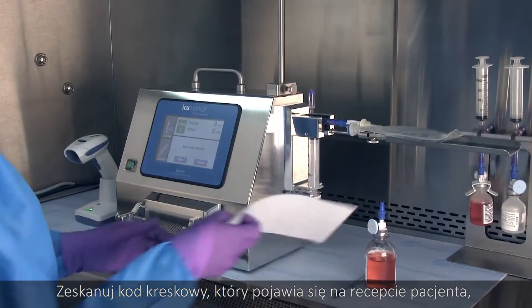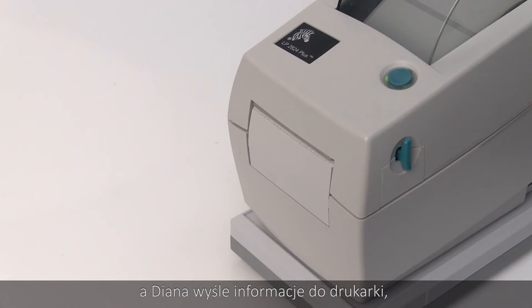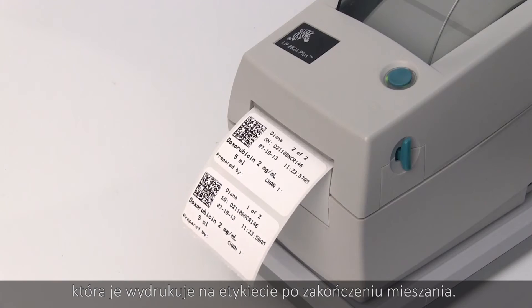Scan the barcode that appears on the patient order and Diana will save the order number associated with the code for output to a label when the mix is complete.